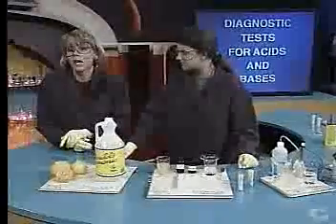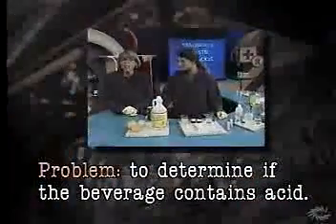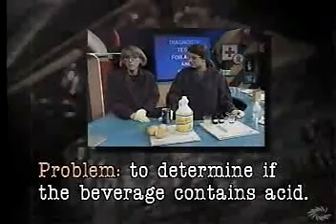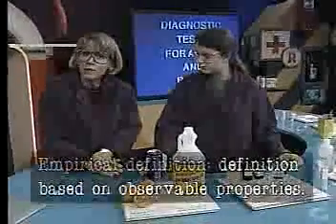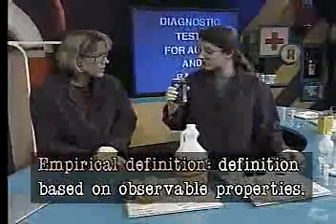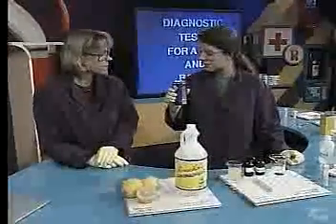How can I tell if an acid or a base is present in this pop? Well, I guess I could read the label, but let's go to the lab instead. Robin and I are going to perform diagnostic tests on acidic solutions and basic solutions. We will use these test results to establish an empirical definition for acid and basic solutions. That will help me determine whether or not acids and bases are present in this beverage, right?